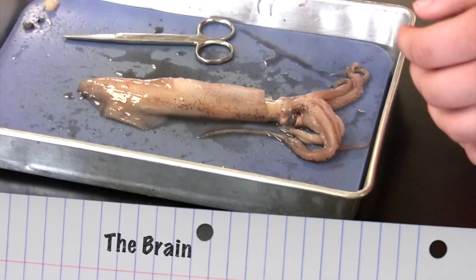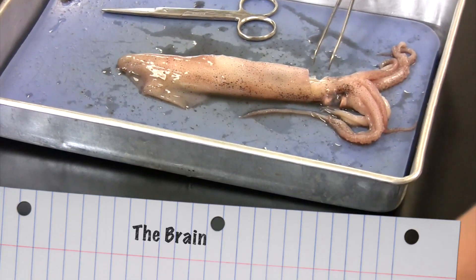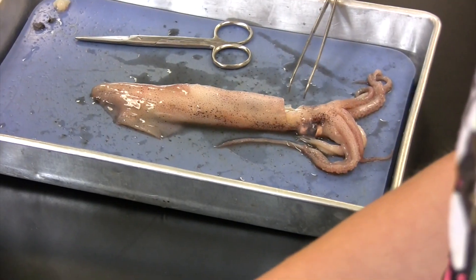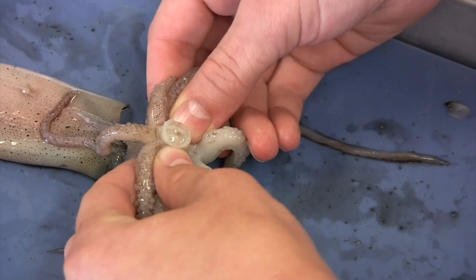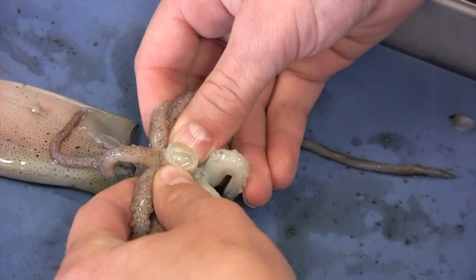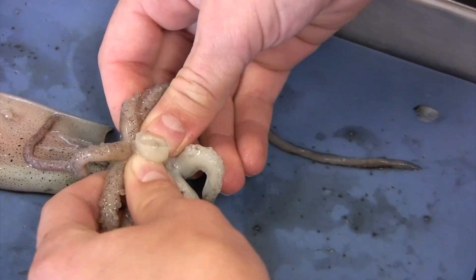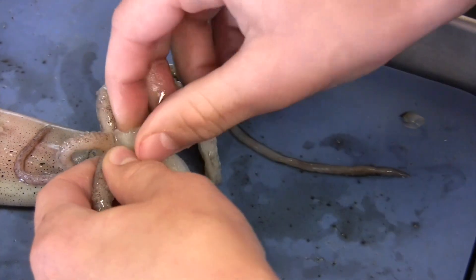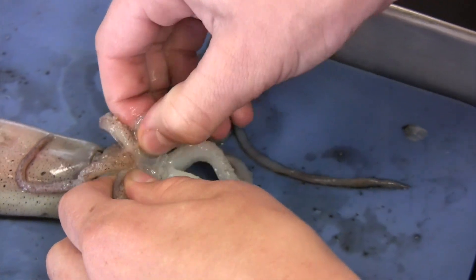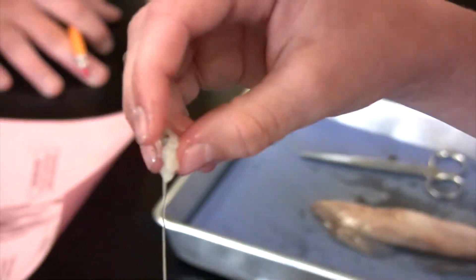So I'm going to be taking out the brain. You have to take out the beak first because it comes out of the mouth. You take away the tentacles and the arms, then you squeeze it and you see it starts coming out. You start squeezing it like a pimple and it starts to come out even more. Eventually it'll get far enough that you can just take it out with your hands. You can see the nerve that comes out, and then there's the brain.